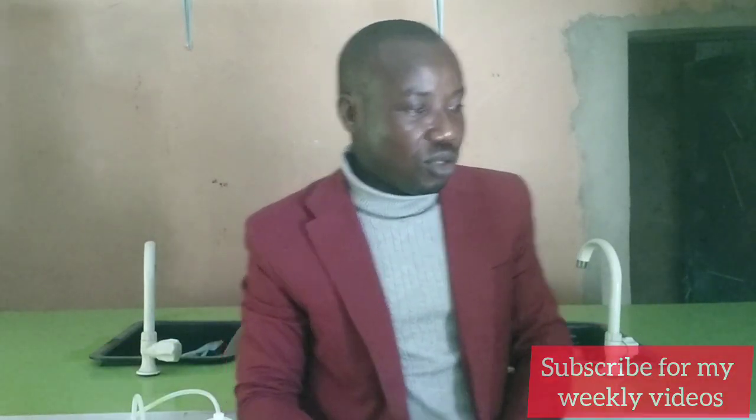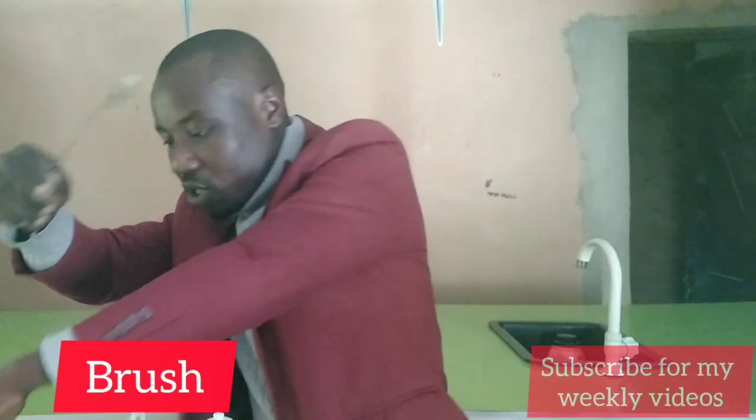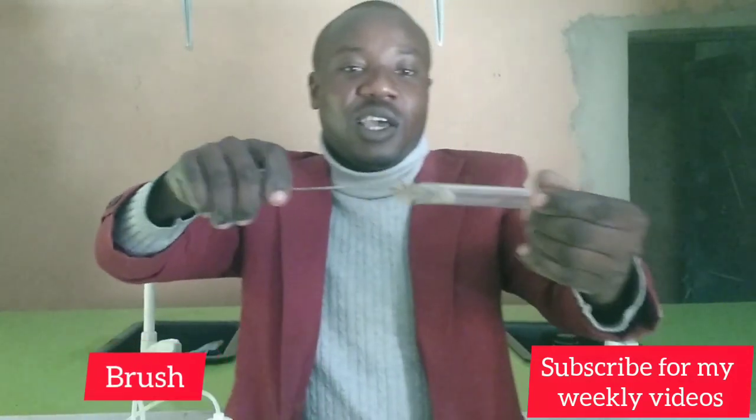Another one I'll be showing you is brush. Yes, this is brush. We have different sizes. The one I have here is very small. I can use it in washing. Let's say when I'm done with experiments, I can put it inside, then I'll wash instead of putting my hand, even my hand will not enter. It's not even advisable because it's a chemical.